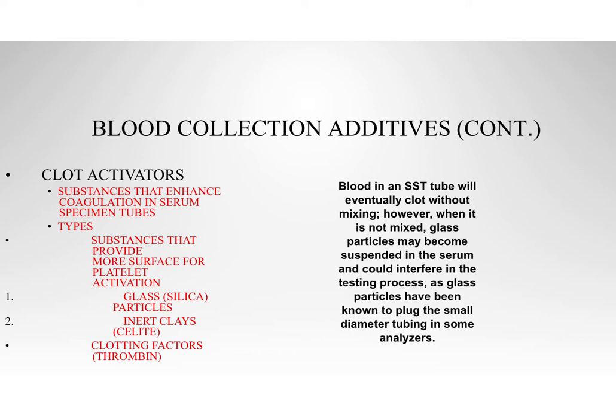So the first one that we're going to talk about is the glass particles. You do need to know another name for glass particles is silica particles, okay? And those are a just slightly different version. You know those little packets that come in like purses, stuff like that. You know, have the little balls. Those are like silica. So this is a kind of a version of that, but on a microscopic level, okay?